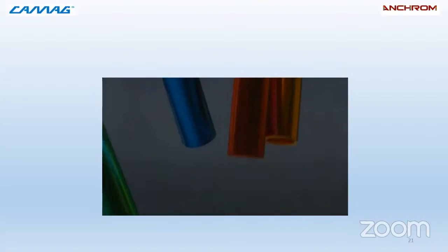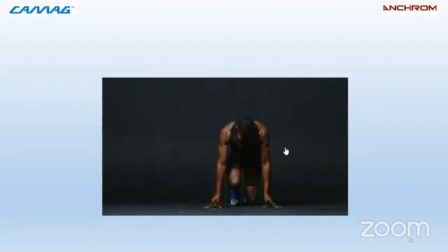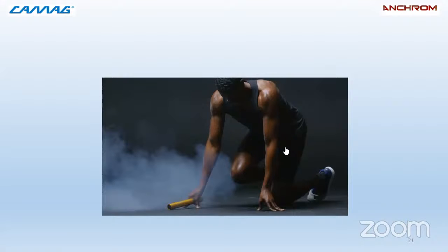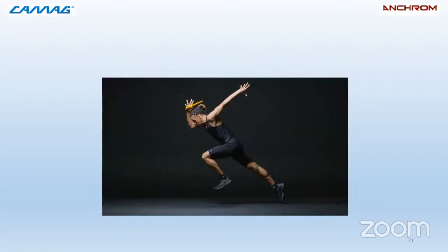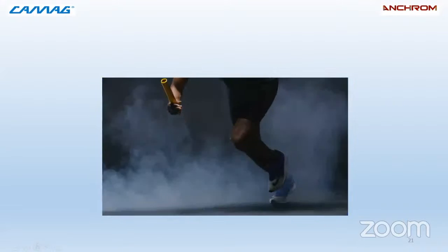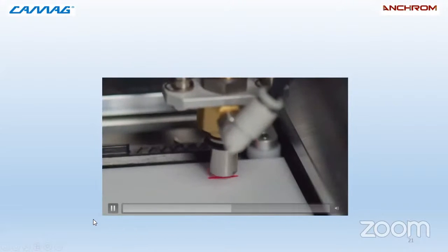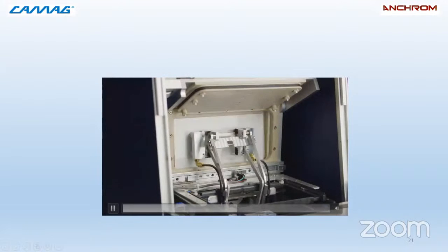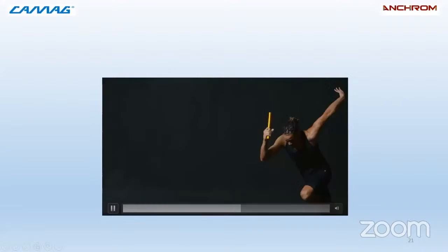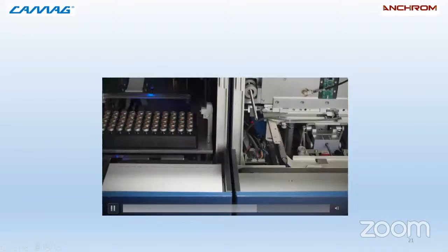You can give a program for 5 different plates at the same time. This is how you can understand how it works. Until now, they have launched only 2 modules, applicator and development module. Soon they will launch other modules. Now we will see CAMAG HPTLC regulatory compliance.